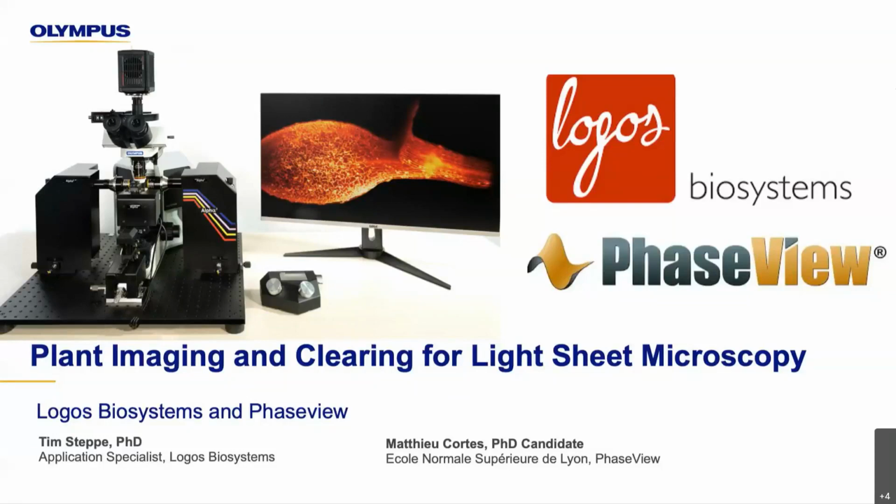I'd like to welcome everyone today to this webinar titled Plant Imaging and Clearing for Light Sheet Microscopy. In recent years, light sheet microscopy has become a key imaging method for plant biology. With new clearing methods available, it's even easier than before to study plant development. However, more recent research studies are looking to apply light sheet microscopy techniques to focus on root imaging, requiring new methods for sample mounting and imaging to be developed.